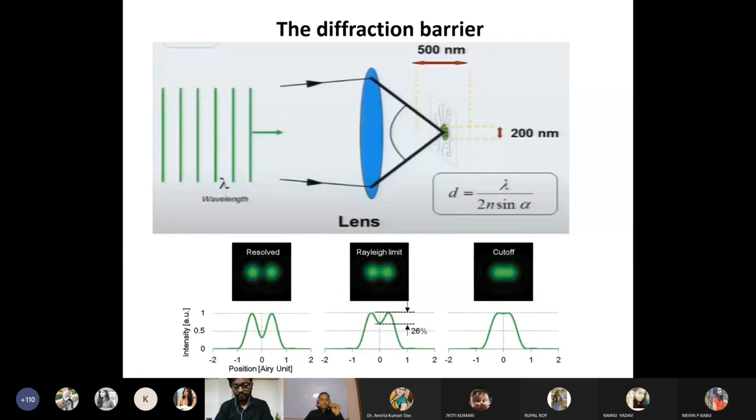So what is diffraction barrier? Let me first tell you that the diffraction barrier renders a limitation to the confocal microscopy. Okay, we have seen so many good images, that the pollen grain has such a good image. So let's talk about a little more magnification. Then the resolution comes into play. If we magnify a little more, then we have to struggle with the resolution part.